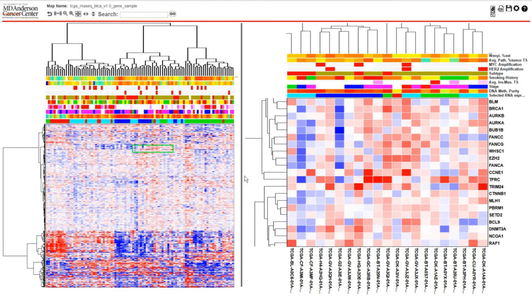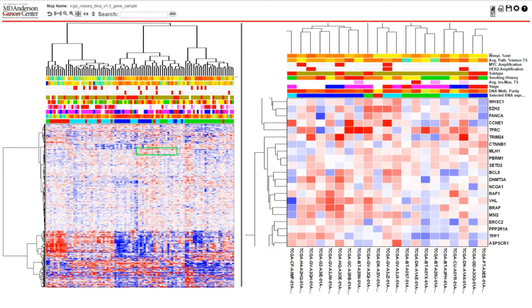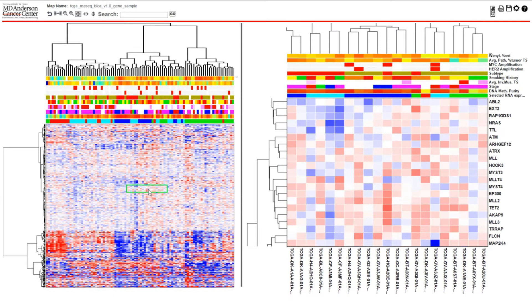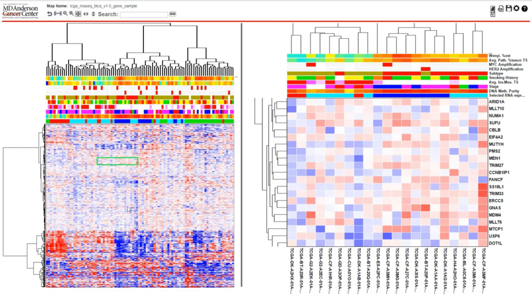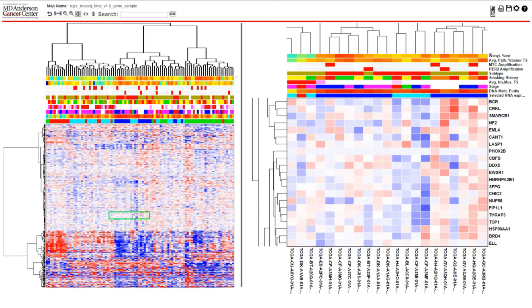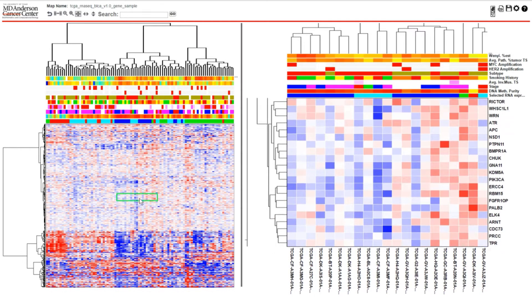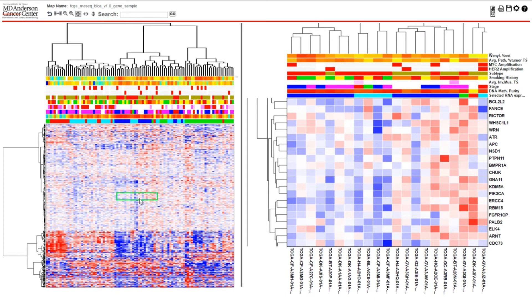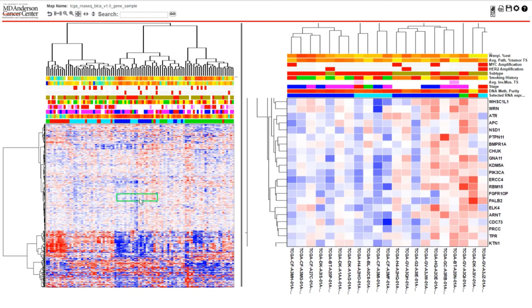The green box in the summary view indicates the portion of the heat map that is currently displayed in the detail view. You can left-click anywhere on the summary view to change the information shown in the detail panel. Alternately, you can use the arrow keys on your keyboard to move the detail view in any direction one row at a time.